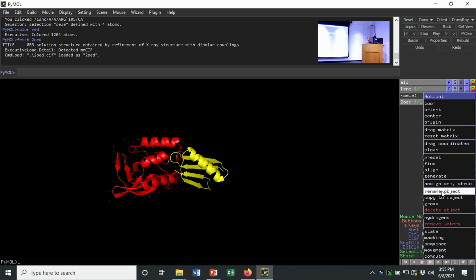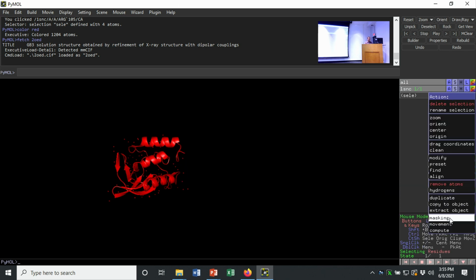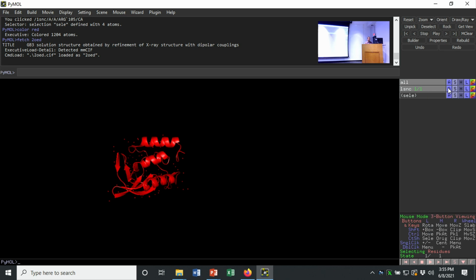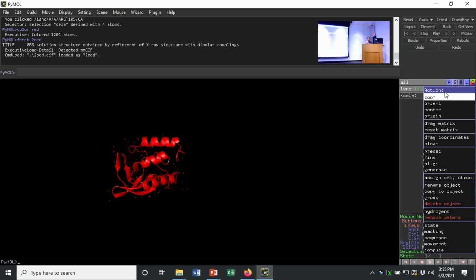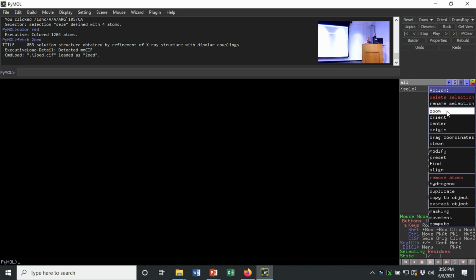So let's load something a little bit different. So I'm going to delete both of these. So I can go here to Action, and I can delete. So this first button, I guess, contains actions. I can delete objects. And so now I have nothing again. I can probably delete this selection.